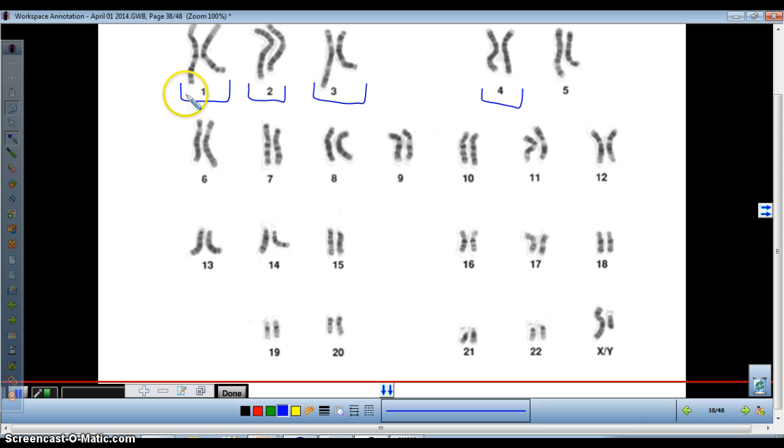The chromosomes would be matched up based on size, banding pattern, or gene location, and they would be paired up in homologous pairs. So these are homologous chromosomes.